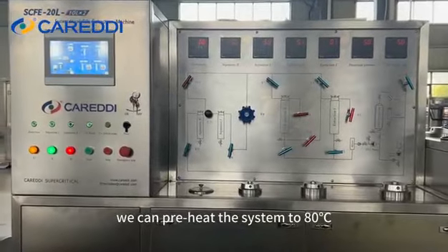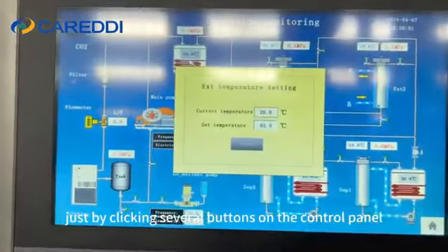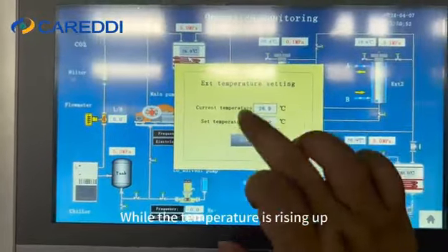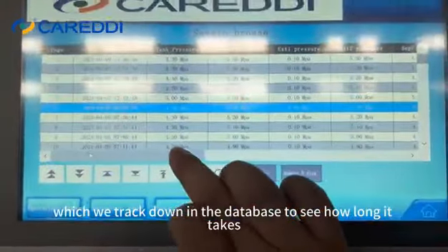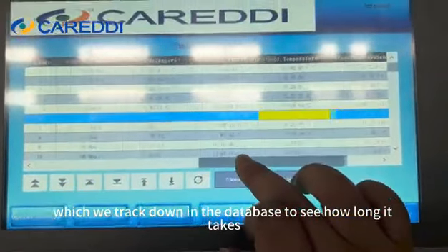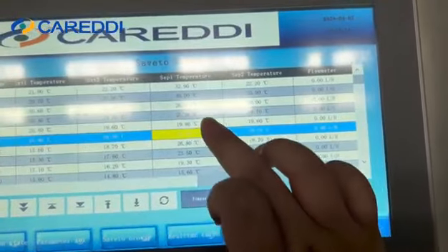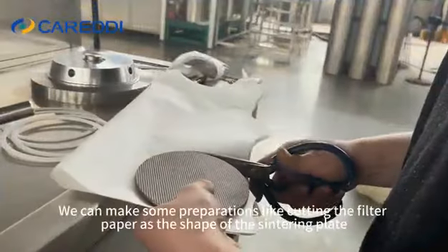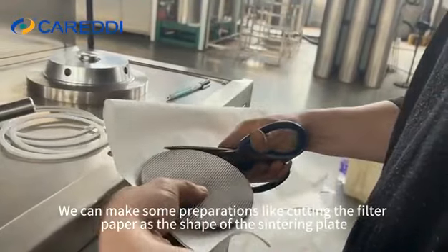During this time, we can preheat the system to 80°C just by clicking several buttons on the control panel. We can track the rising temperature in the database — it updates every 5 minutes. We can also make some preparations like cutting the filter paper to the shape of the sintering plate.